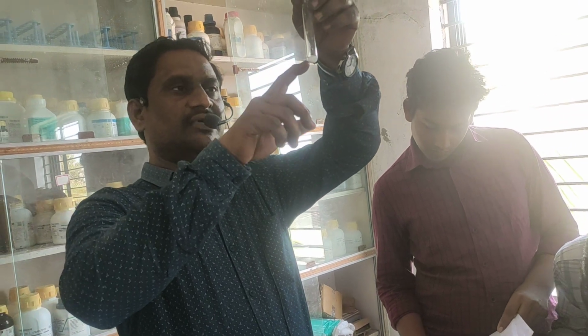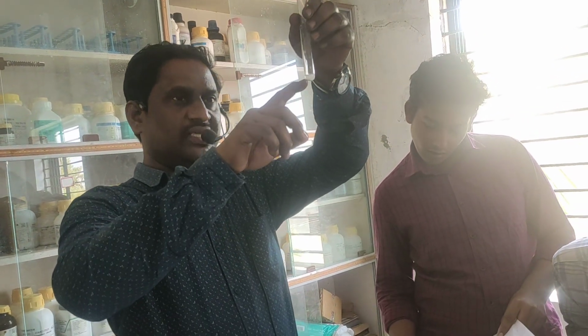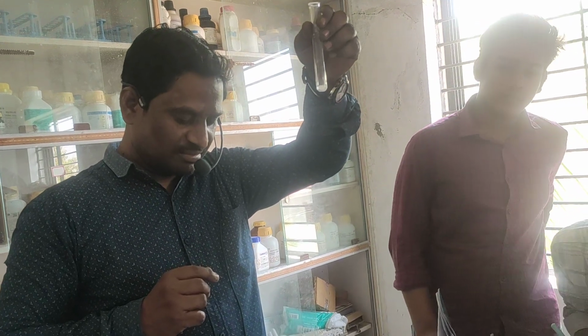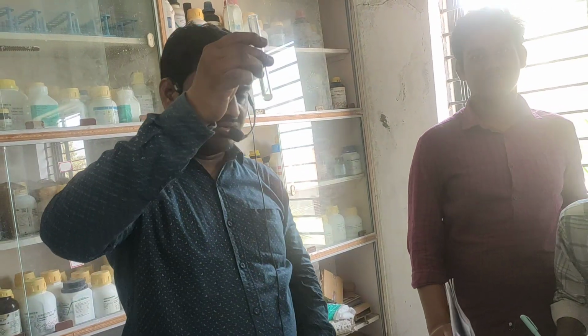It turns lime water milky. CO3 minus 2 is present. Now we have to do the confirmation test. The confirmation test is also the same. So what should we do for the confirmation test?